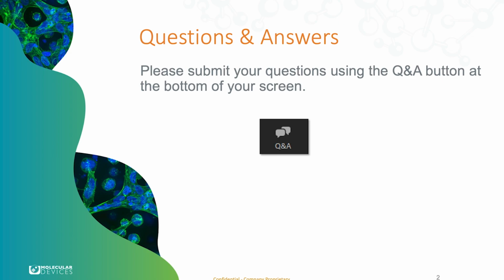And one last question. What parts of the software are responsible for the AI portion? It's two parts. It's the AI-based image segmentation, which is a deep learning network. Then we have the clustering software package, the phenoglyphs, as we call them, for phenotypic classification. And then the decision making itself, which would represent AI on the system. So it's centered around decision making and image analysis that makes up the AI part of the system.